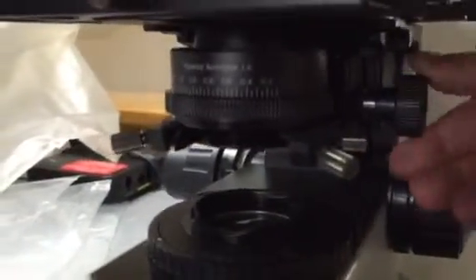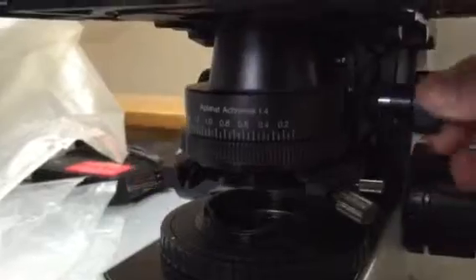First thing you want to do is use this knob right here to rack the condenser lower. So we're just going to twist that and move the condenser down.